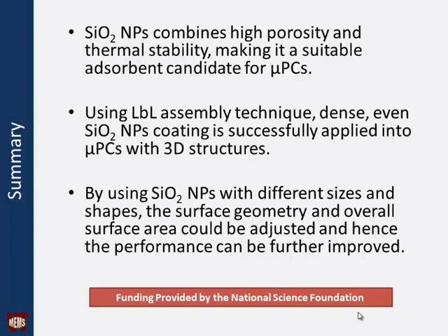With this one, we can really take it even to Tenax temperatures. We have shown we can take it to 400 degrees C. With this, we can take it to 500, 600 degrees C. So any semi-volatile compounds that adsorb on it can be desorbed.